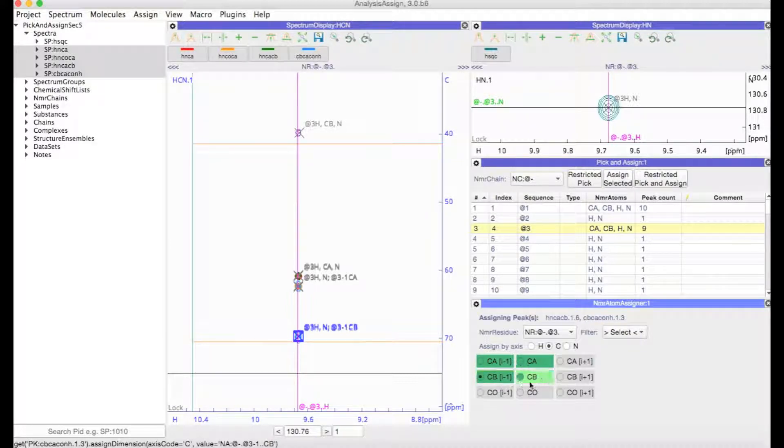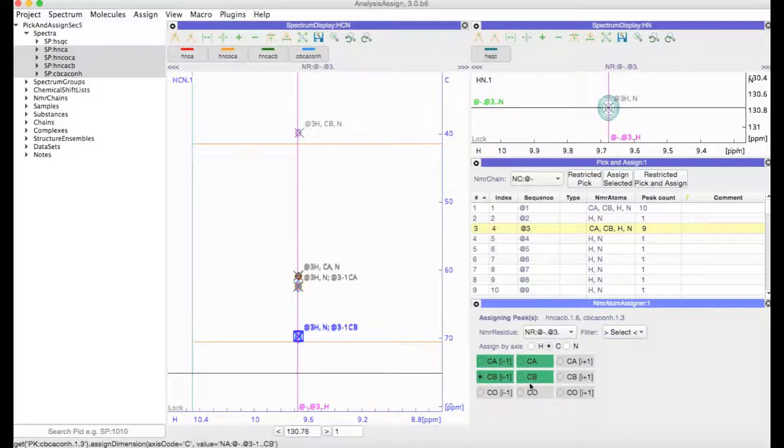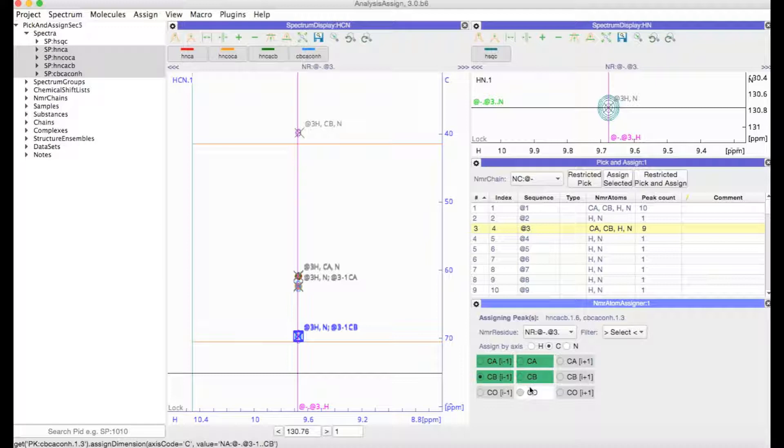You will see that quite often selections are highlighted in green. That's just to help guide your eye, make suggestions for what this NMR atom could be.